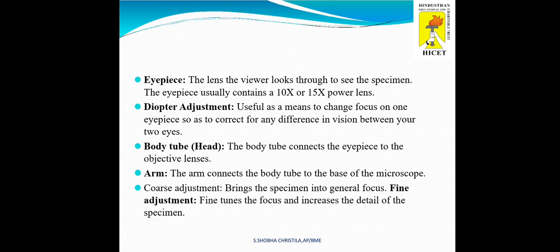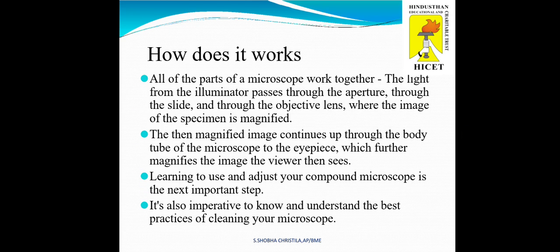Arm. The arm connects the body tube to the base of the microscope. Coarse adjustments. Brings the specimen into general focus. Fine adjustments. Fine-tunes the focus and increases the detail of the specimen.